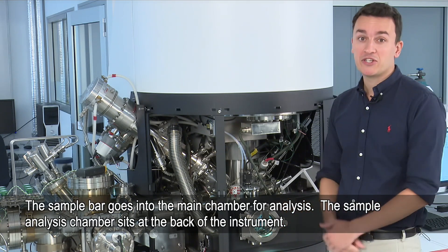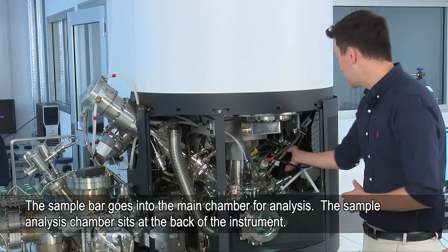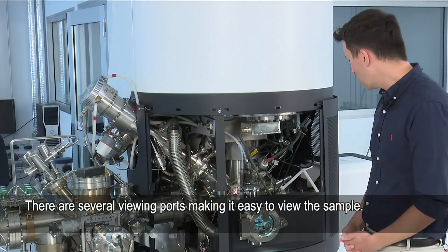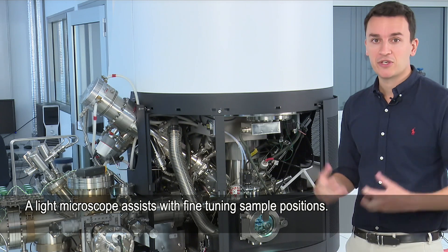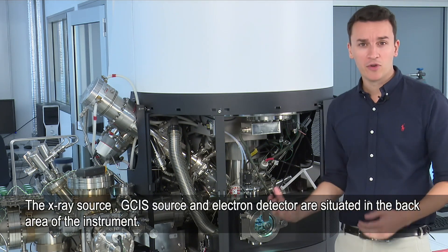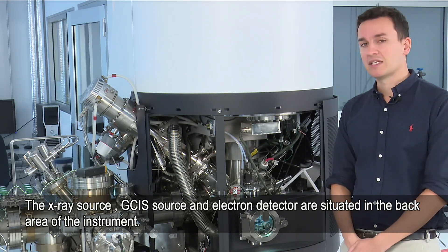When the sample bar is ready it goes into the main chamber for analysis. The sample analysis chamber is the part at the back with all the different ports. It has a few viewports which we can use just to visualise the sample. We've also got a microscope in there which we can use to fine-tune the positions, and of course we've got the X-ray source, the GCIS source, and the electron detector right at the back.